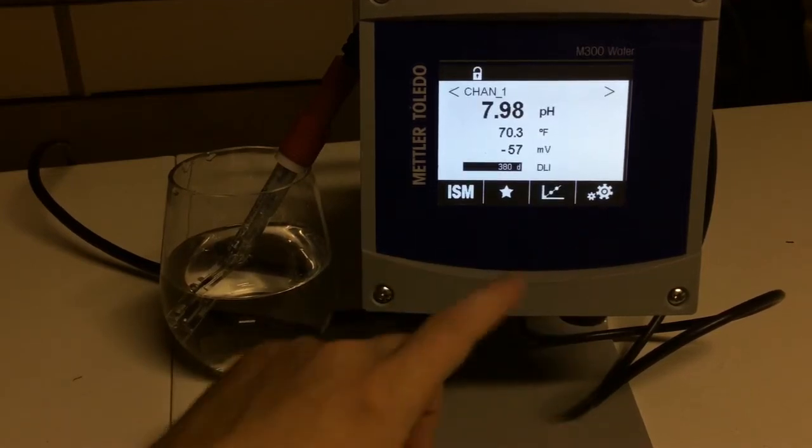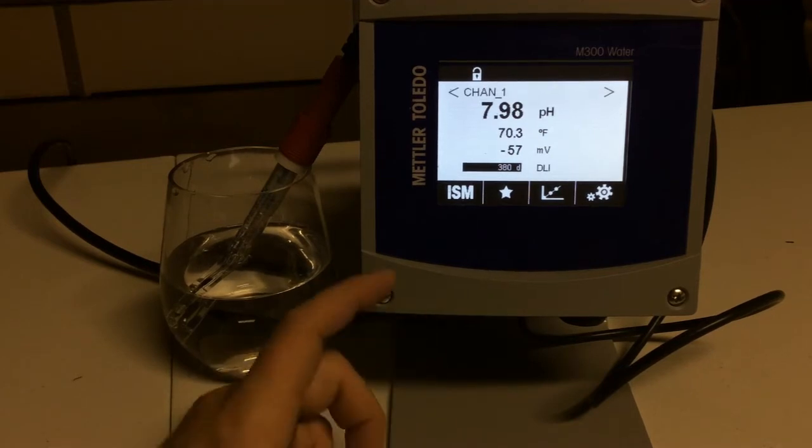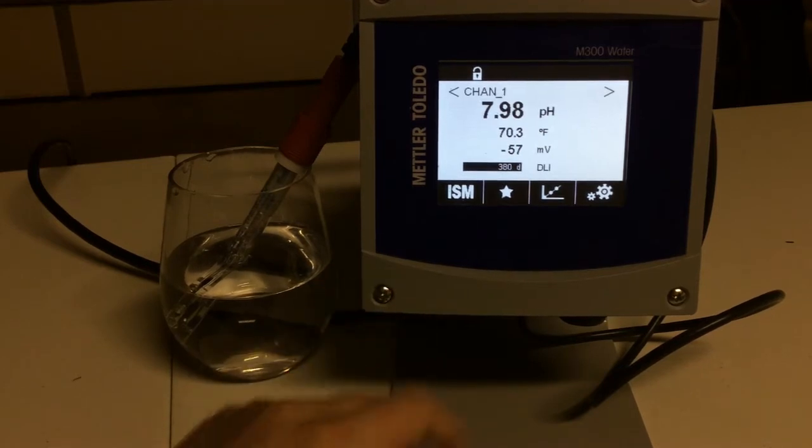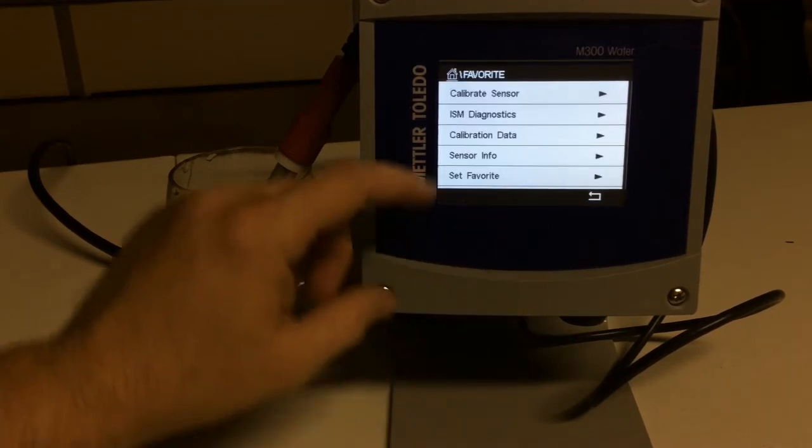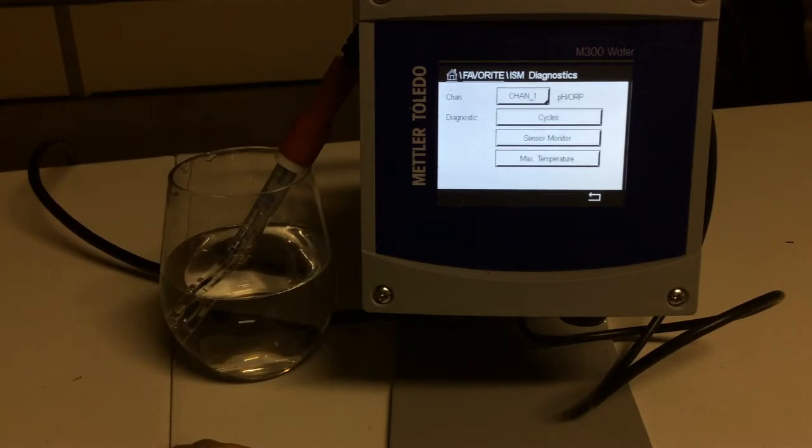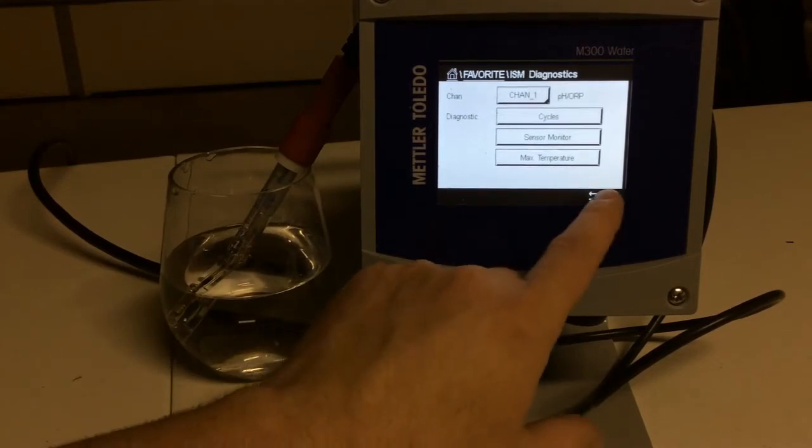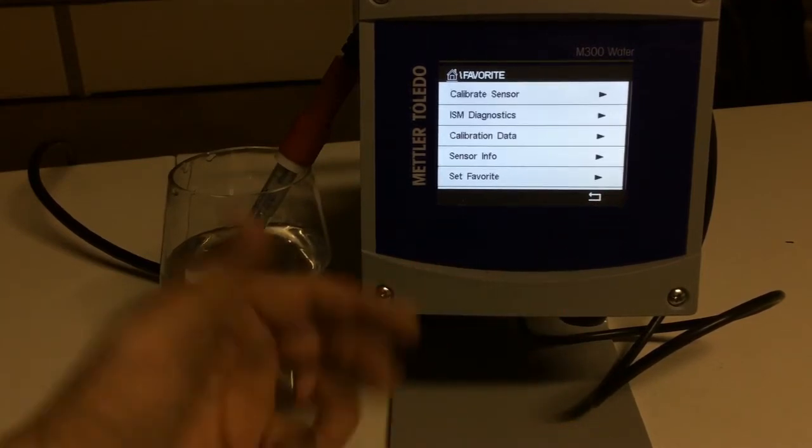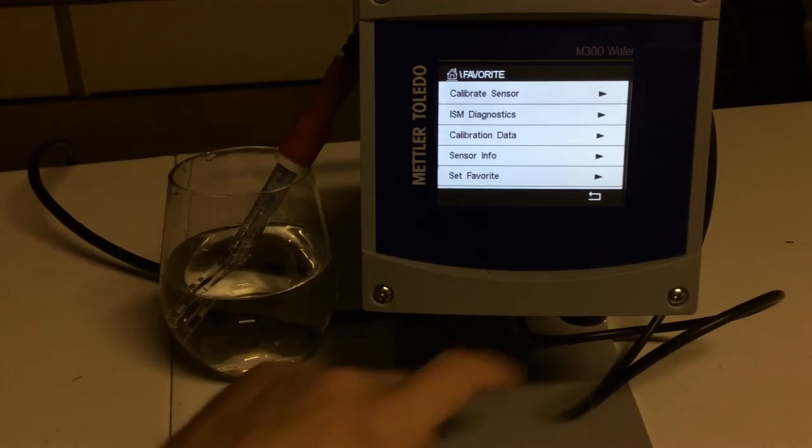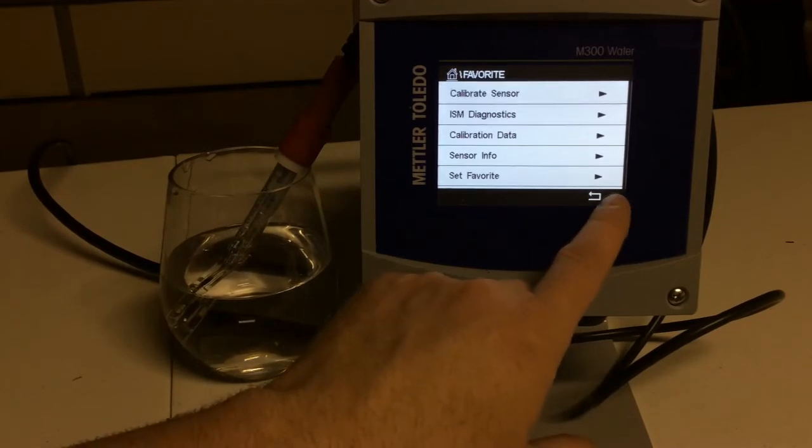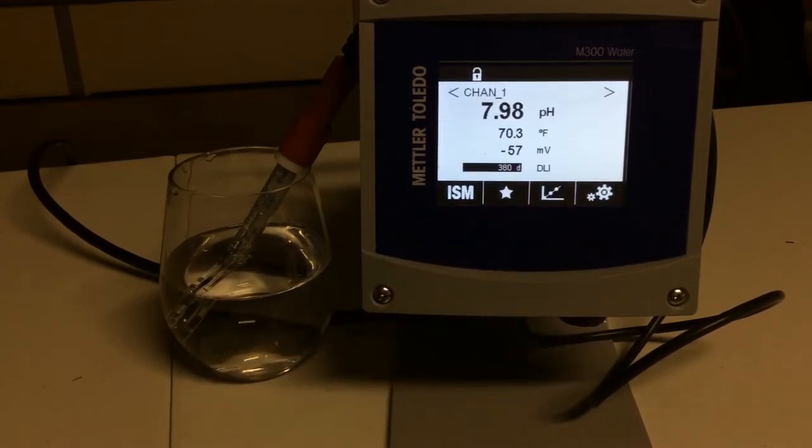So if we come back here, our favorites tab, this is basically just a shortcut menu. So if we hit this and we wanted to go to ISM Diagnostics, we're there. Just whatever's most beneficial for you is what you'd put in that, and you can customize the favorites tab however you want.